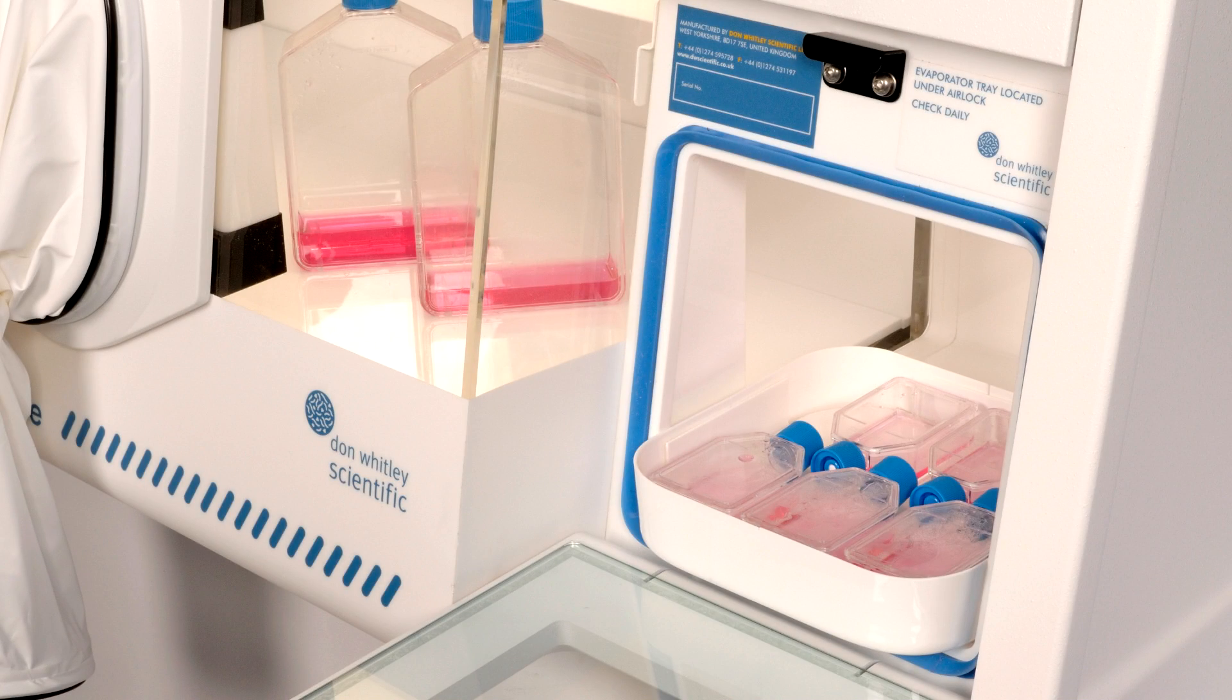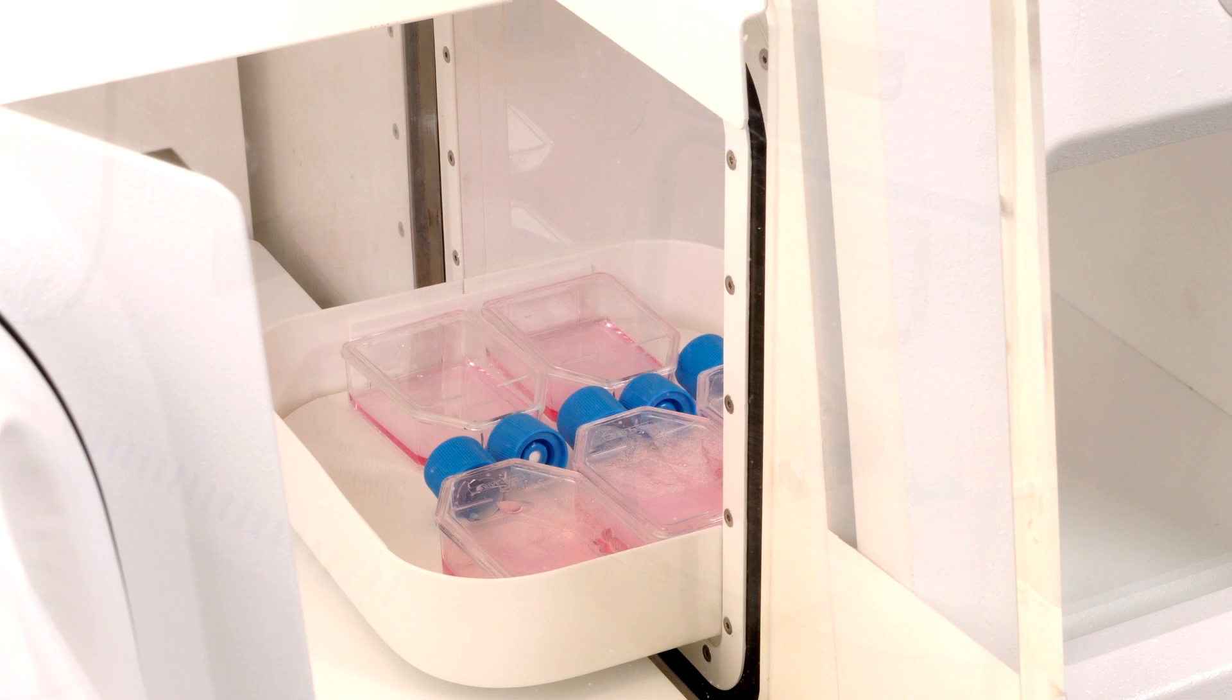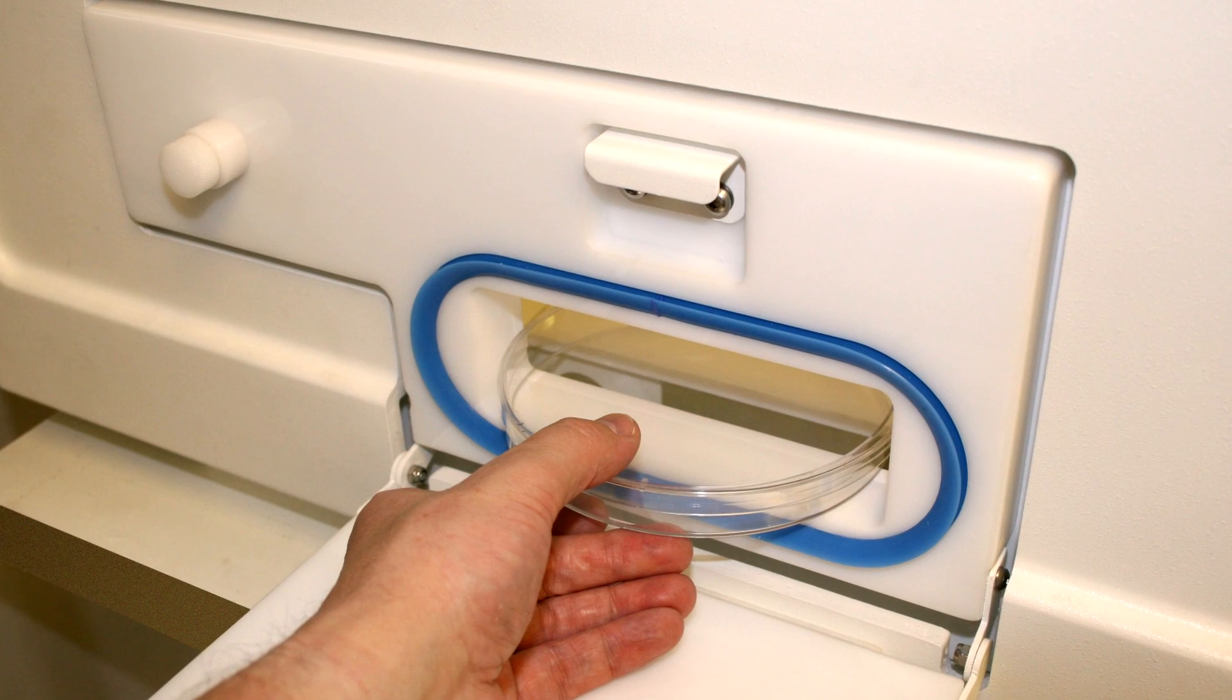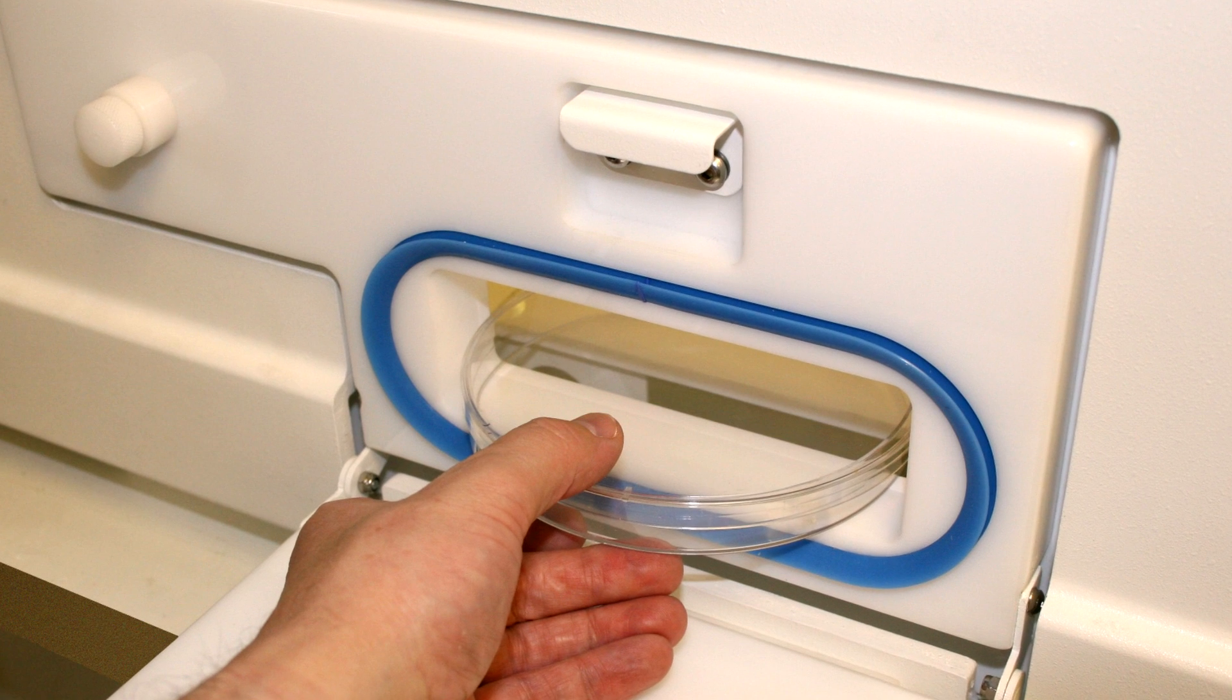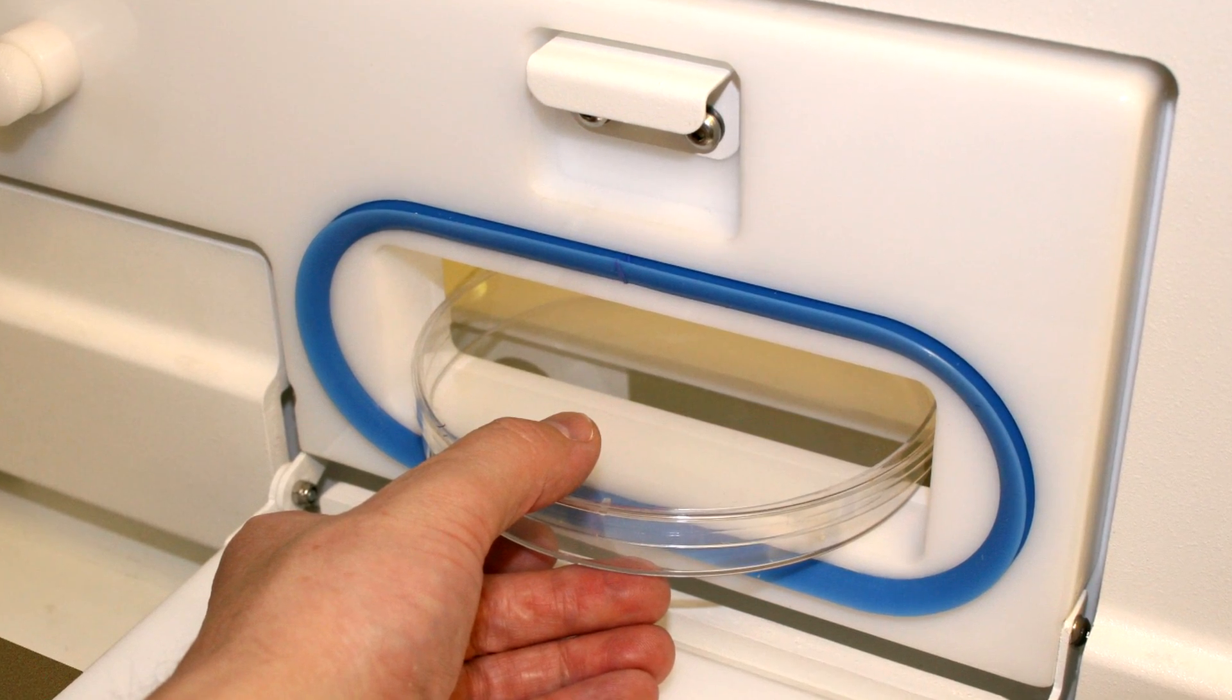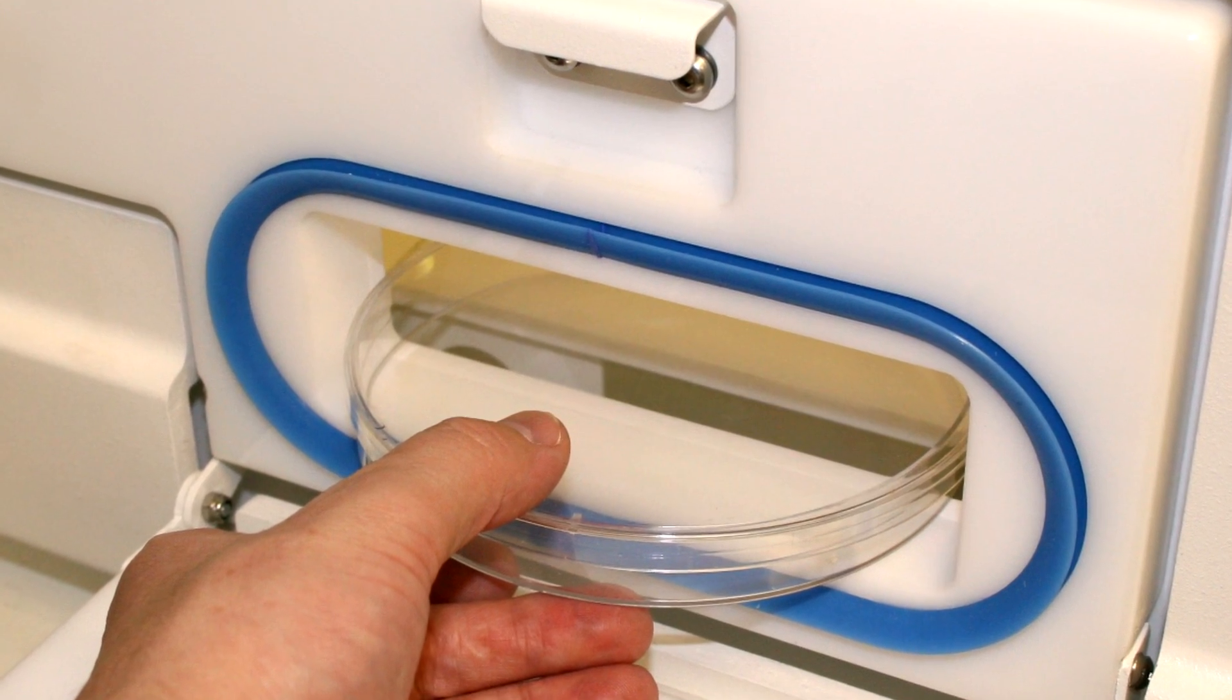Every A35 is equipped with a transfer airlock to introduce samples or equipment. The 12 liter rapid cycle airlock has the capacity to introduce up to 40 petri dishes in 60 seconds. There is also the option to specify the 15 centimeter letter box, ideal for quickly transferring all sizes of dishes and small items.